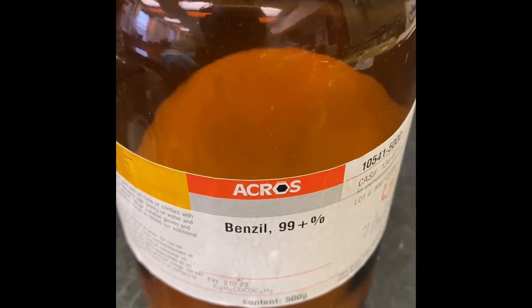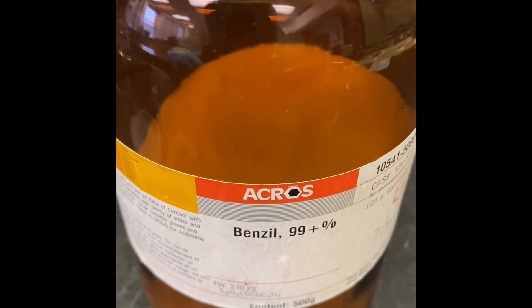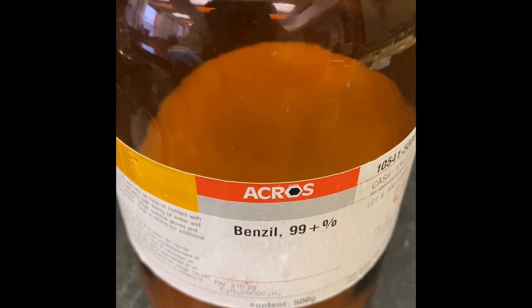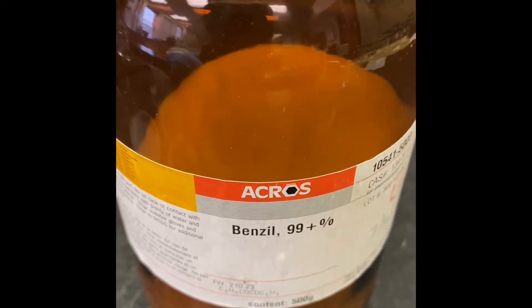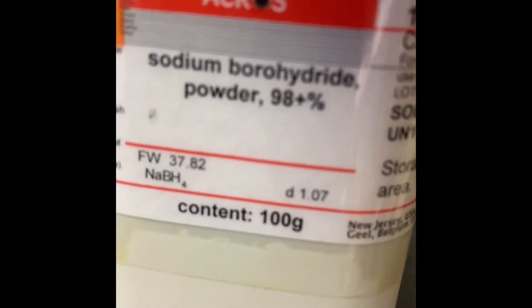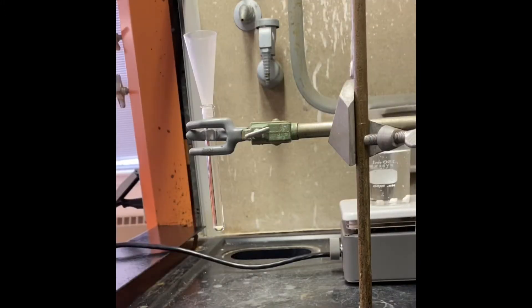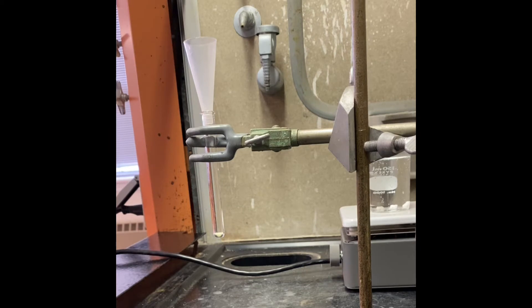In today's experiment we're going to use benzil and we're going to do reduction with sodium borohydride. 50 milligrams of benzil as the reduction reagent, we're going to use sodium borohydride. Right now I have 50 milligrams of benzil in my reaction test tube and I'm going to add 0.5 milliliters of ethanol.